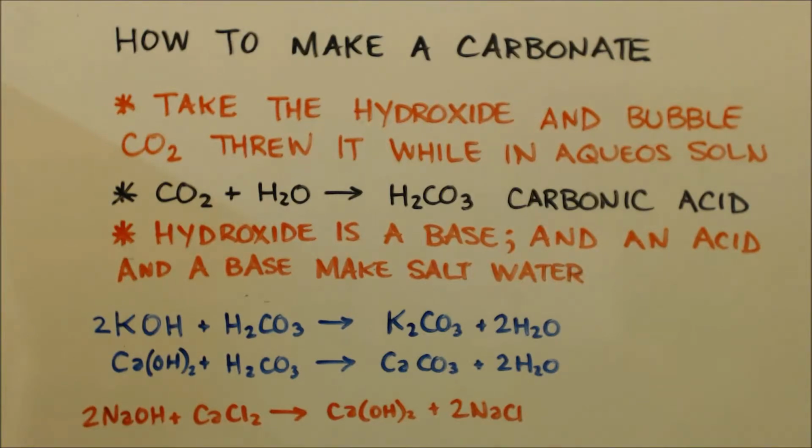And the way I make it is to mix it with sodium hydroxide, because most hydroxides are insoluble except for potassium and sodium. So I mix them together. This precipitates out as my hydroxide, but there's impurities. The salt, because you're going to have sodium chloride now. So I need to get rid of the sodium chloride, right?